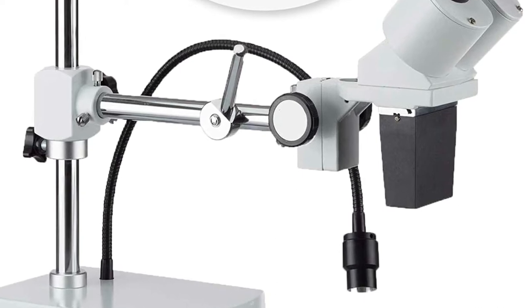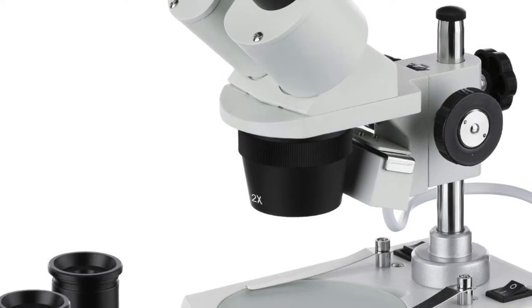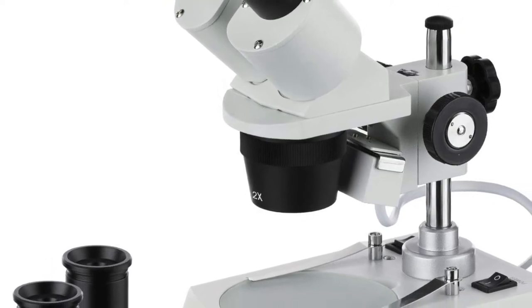This would prove beneficial for inspecting large-scale specimens which may require handling or even repairs. The optical glass lenses allow for sharp images given that they are highly coated in order to ensure high-resolution images.